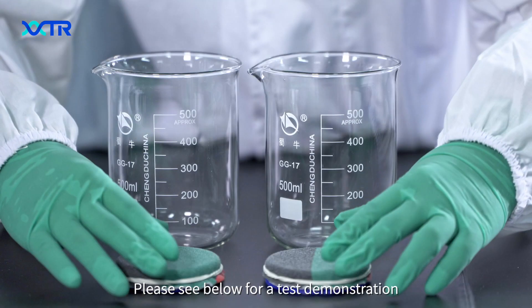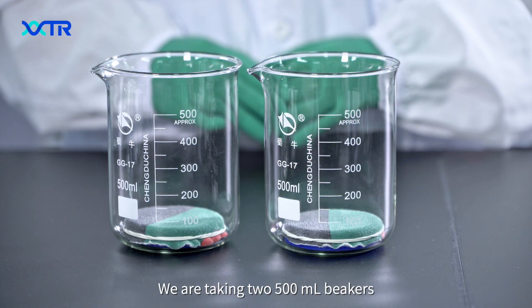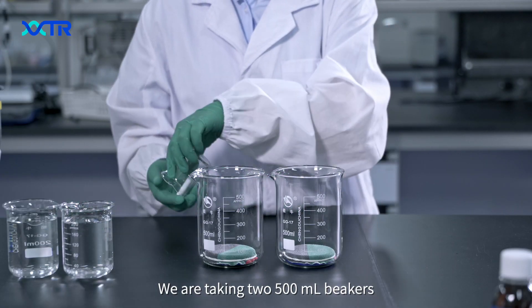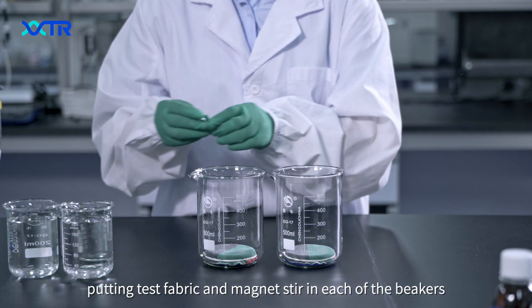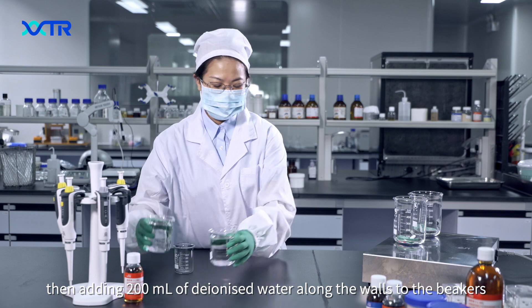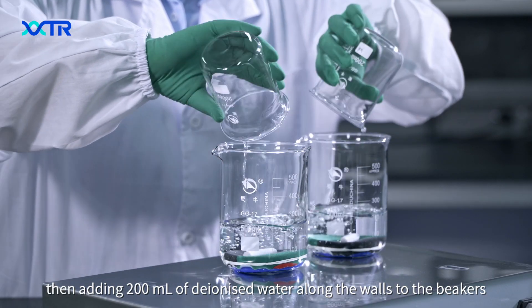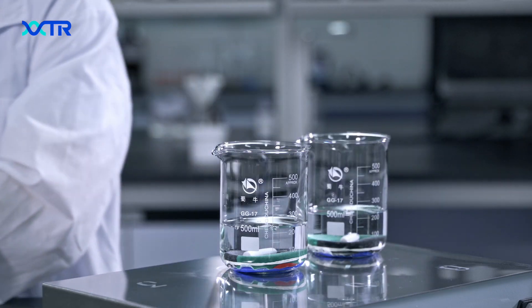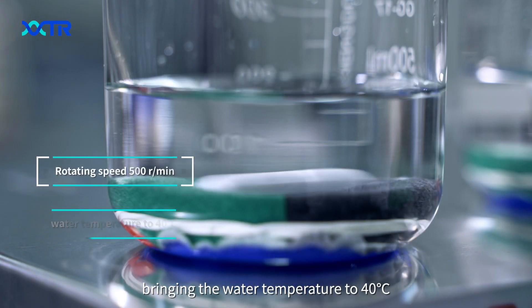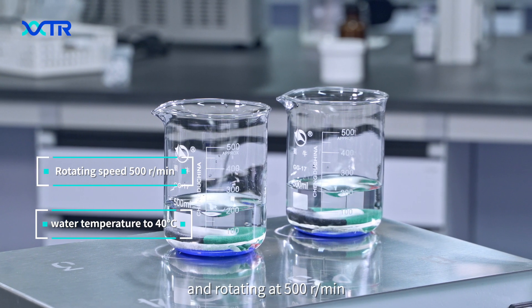Please see below for our test demonstration. We are taking two 500ml beakers, putting test fabric and magnet stir in each of the beakers, then adding 200ml of deionised water along the walls to the beakers, bringing the water temperature to 40 degrees Celsius and rotating at 500 r/min.